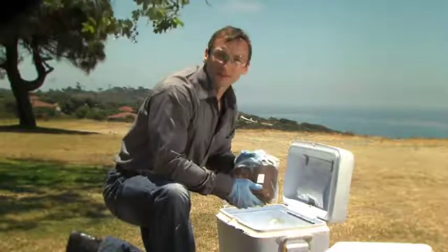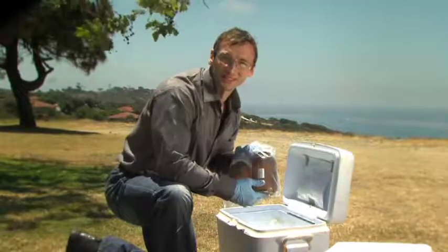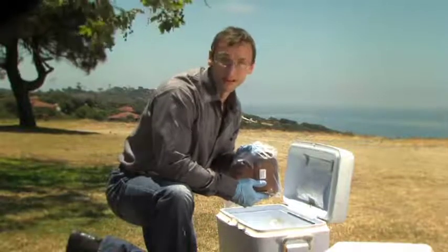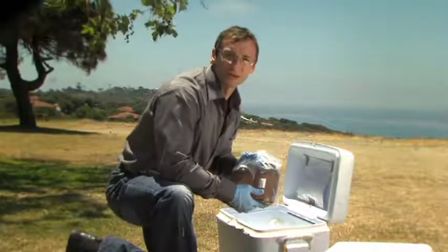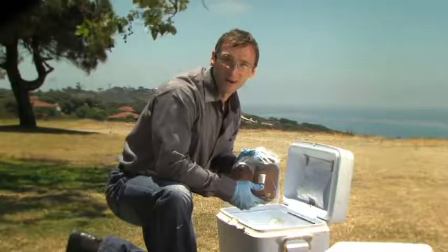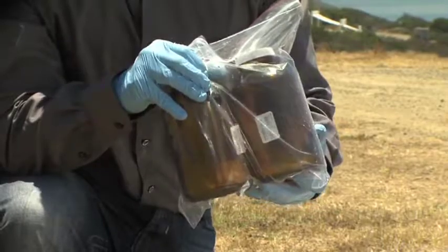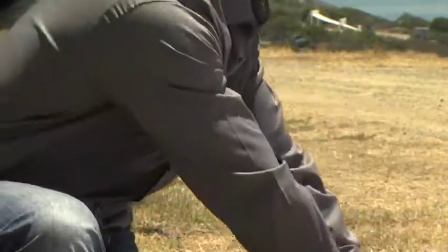As part of the hazardous waste determination, these samples will undergo a toxicity characteristic leaching procedure, or TCLP. The analytes of concern in this waste stream are trichloroethylene and cadmium. Since these samples have a much higher level of hazardous constituents than either our soil or groundwater samples, we are shipping them in a separate container.